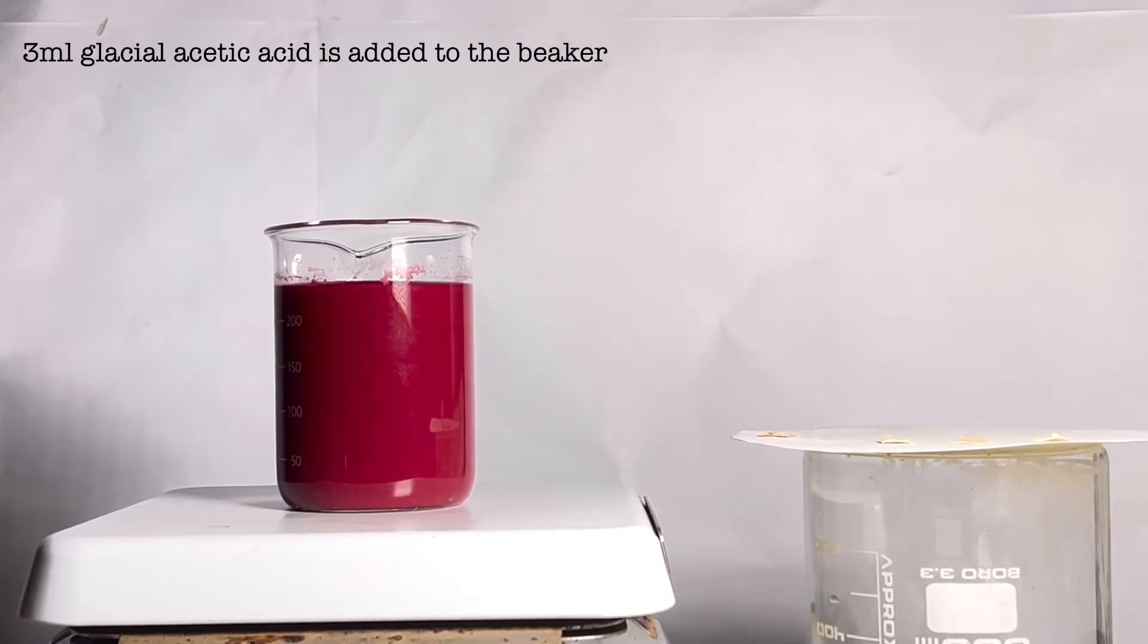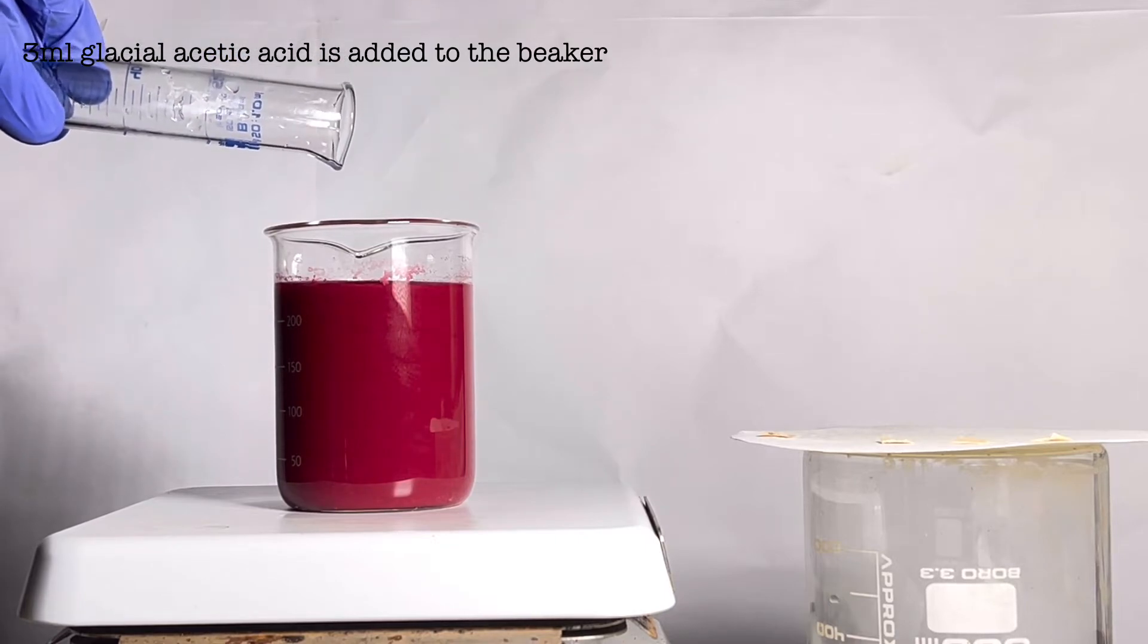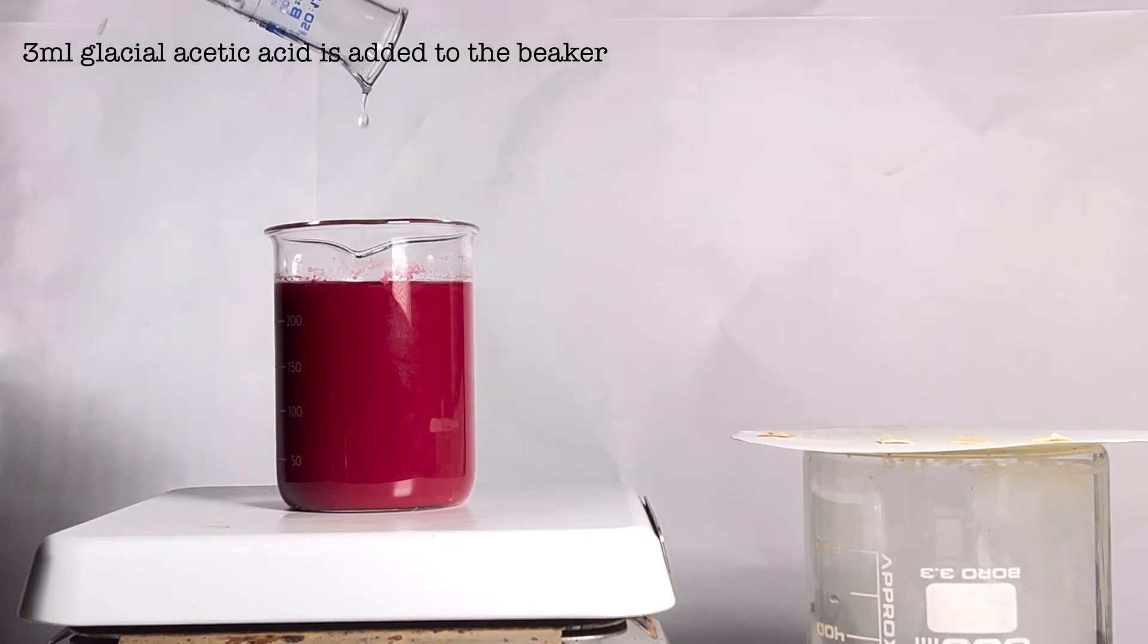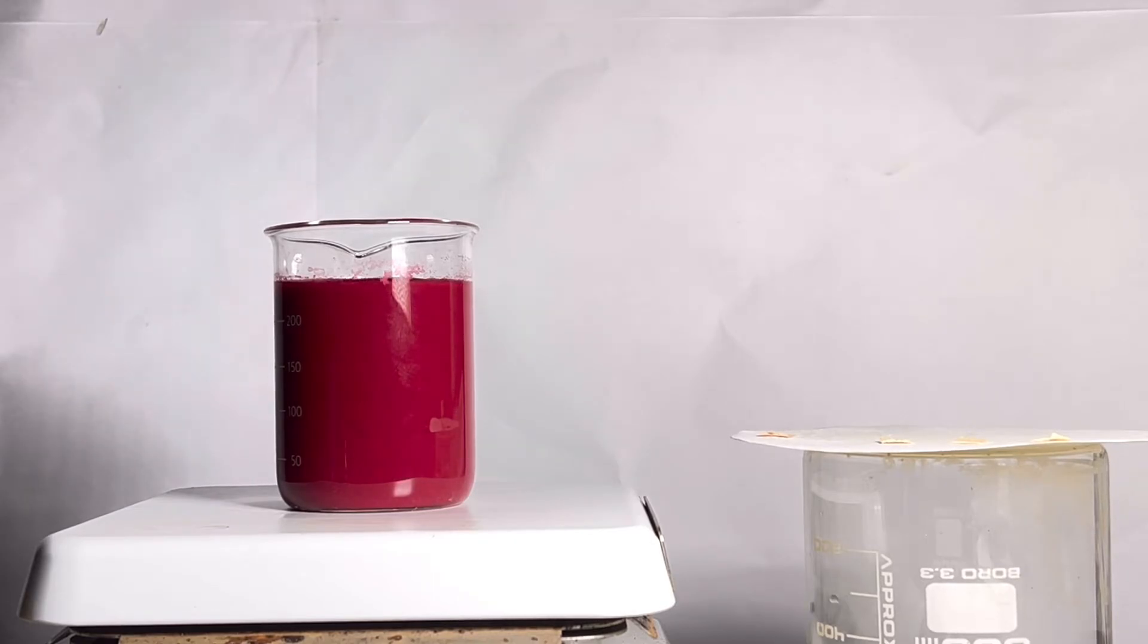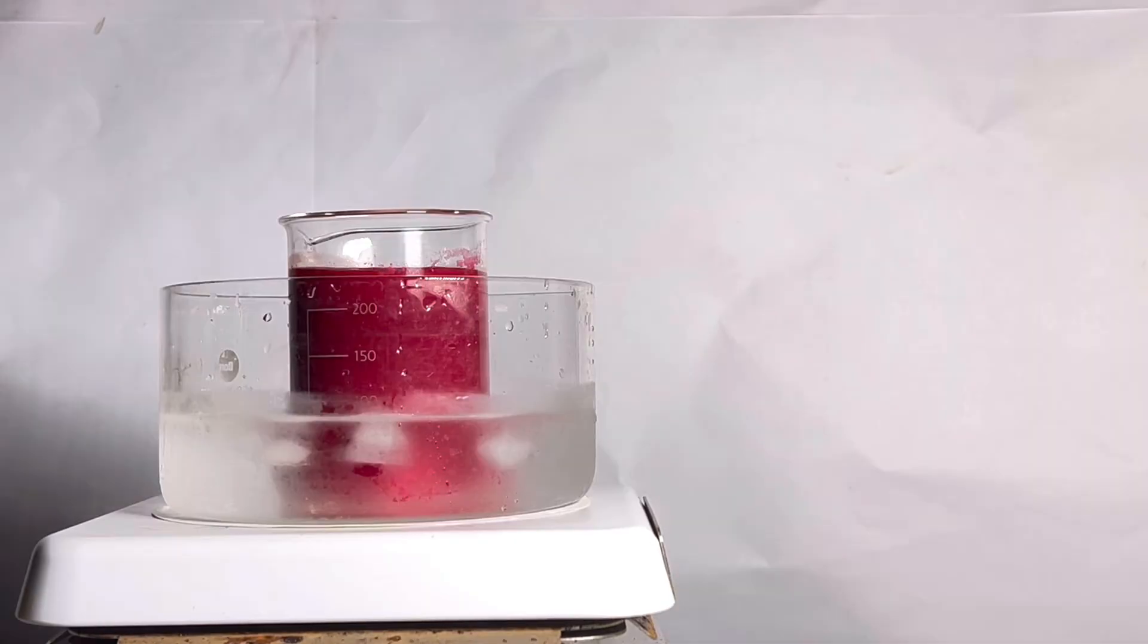Around 3 ml of glacial acetic acid was also added to adjust the pH so that maximum crystallization takes place. Sodium acetate acts as the buffer. Now the beaker is immersed in an ice bath for one hour.